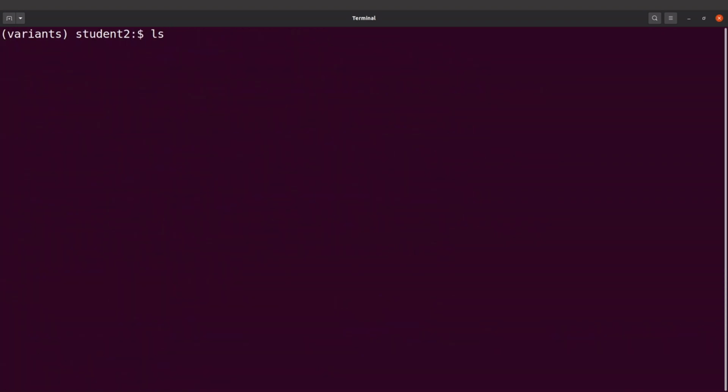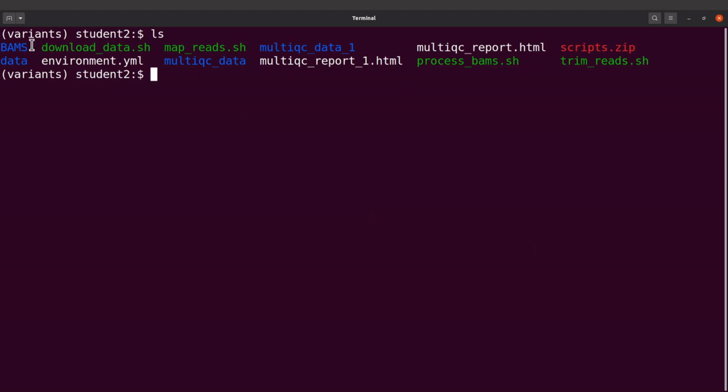If you do an ls, you'll find a directory called bams. Let's ls into that directory and we will see two files here, one for the normal sample and one for the tumor sample. So I have them named as normal.raw.bam and then tumor.raw.bam. I use raw here because these BAM files are going to be processed. We are going to process them further and then get some new BAM files. So let's proceed. So let's look at the next activity.